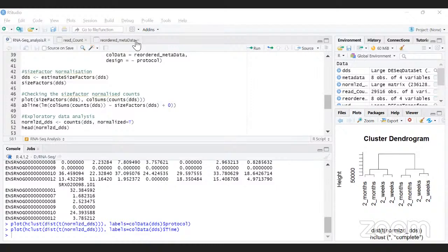Okay. So there is another question from Bhavani. How effective can RNA-seq be used for fine needle aspirant samples? Yes. So fine needle aspirant samples, you mean like fine needle biopsy, right? If it's a fine needle biopsy as well and you have enough sample, you can definitely do it. That all depends upon, for example, if it is a fine needle aspirant, from my experience, you're actually taking a biopsy of a sample, which means there is some diseased condition, right?